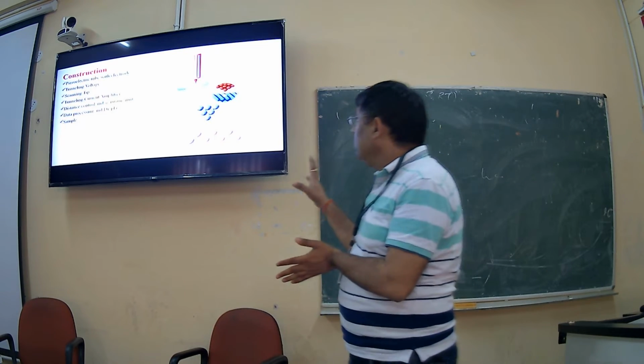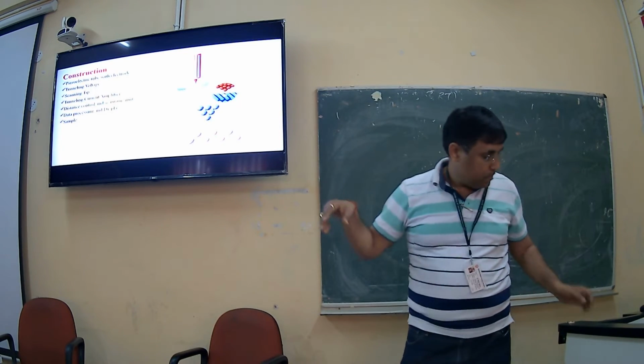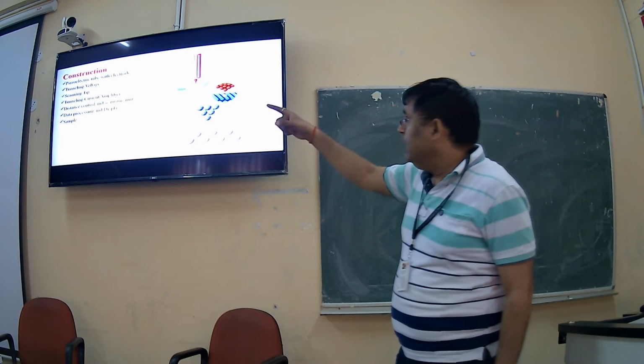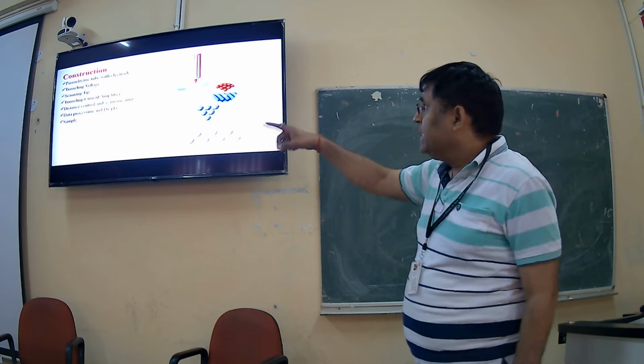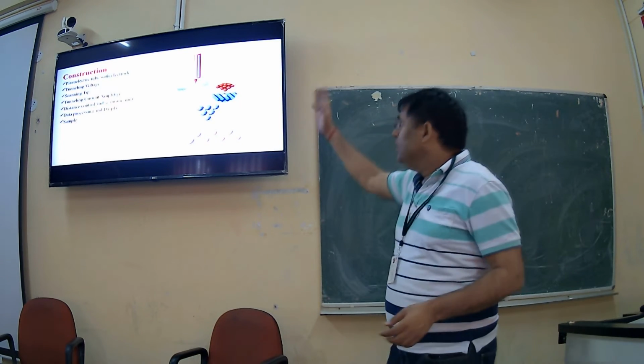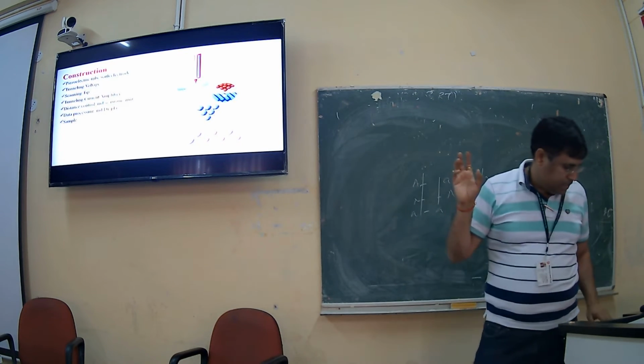Okay, got this point? So here you can see piezoelectric tube with electrode, tunneling voltage, scanning tip, tunneling current amplifier, distance control, scanning unit. So these are basically related to the basic instrument.